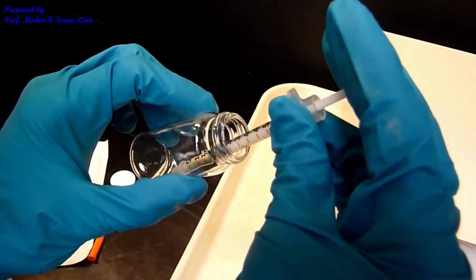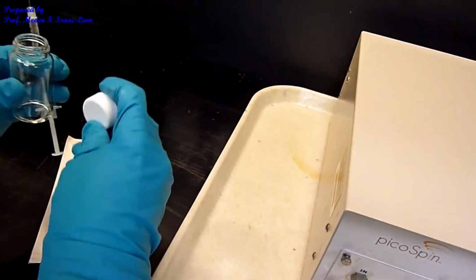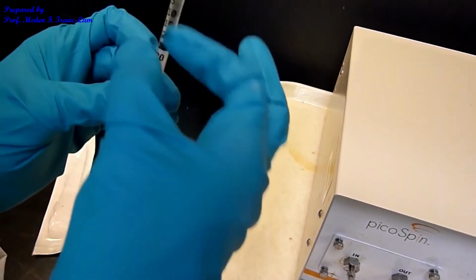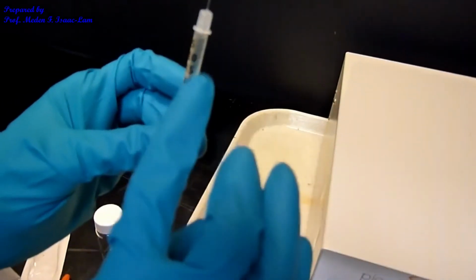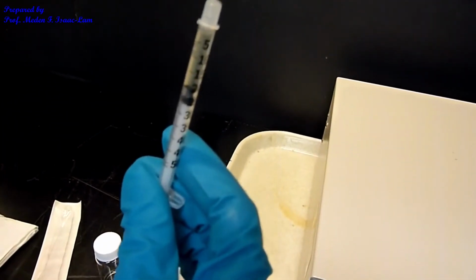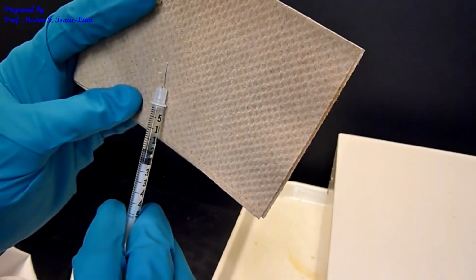So about 200, but I have enough sample. Okay, so I tap it so that the bubbles go up. So I inverted it like that, and then I will try to remove the bubbles.